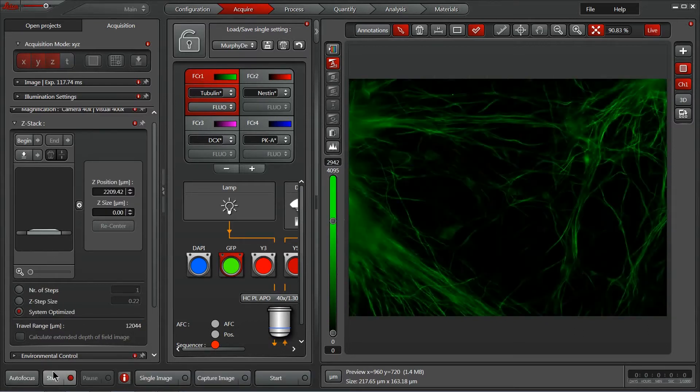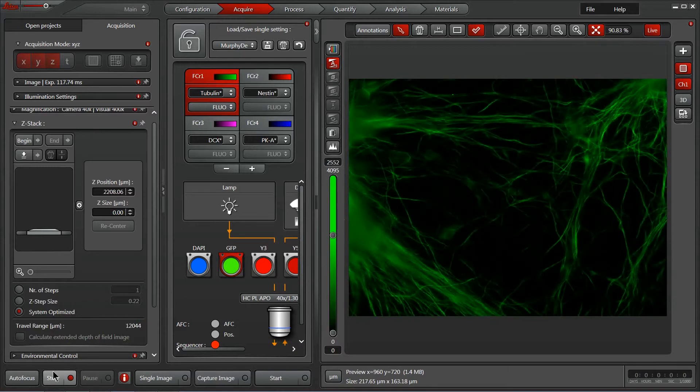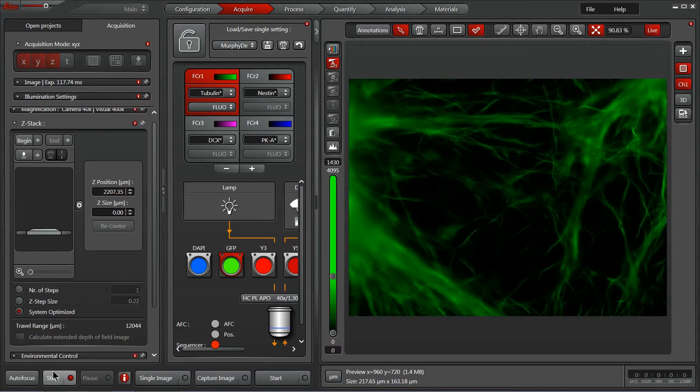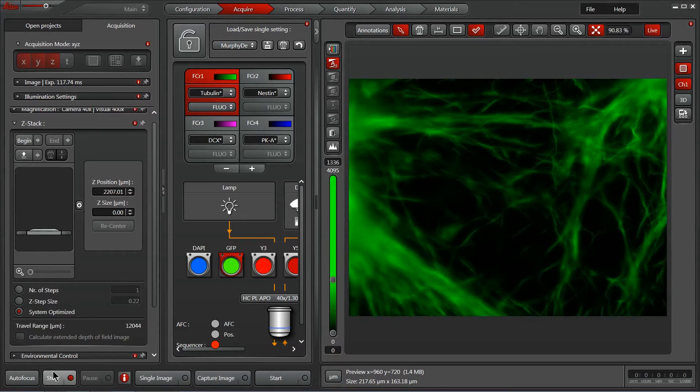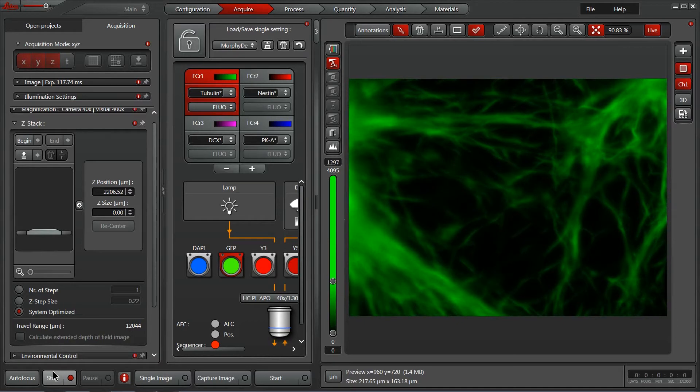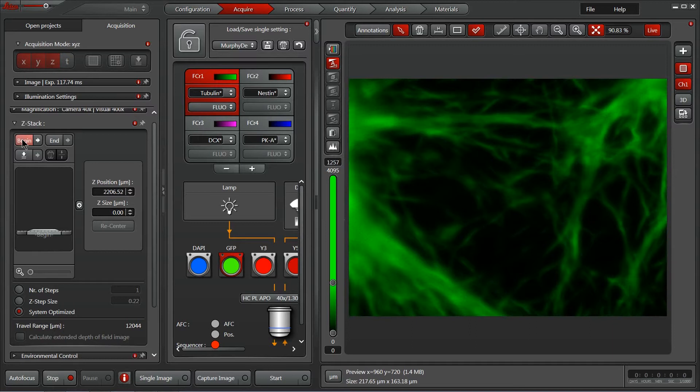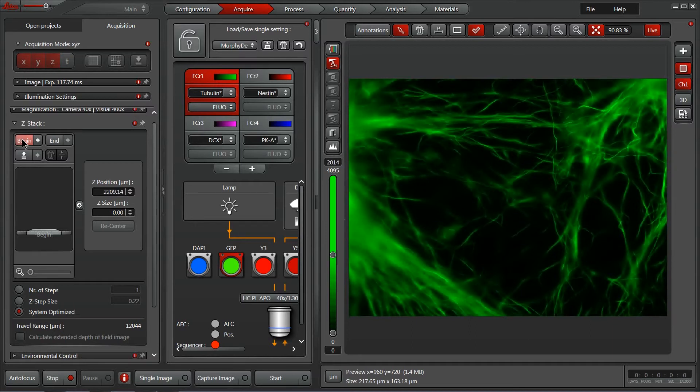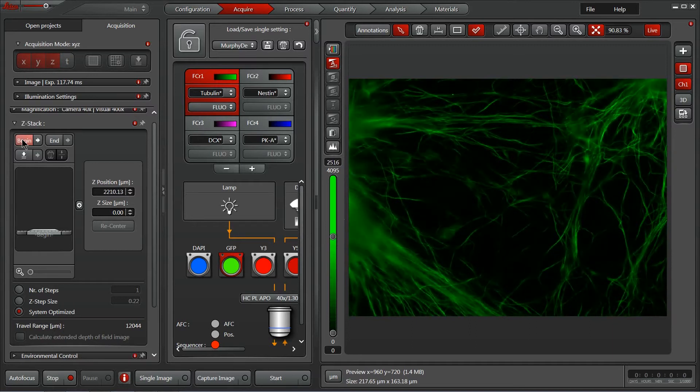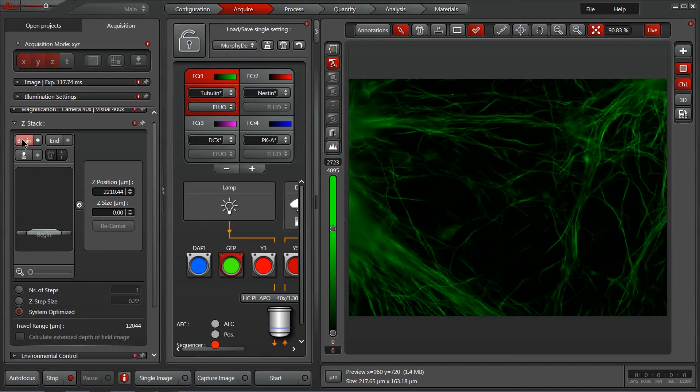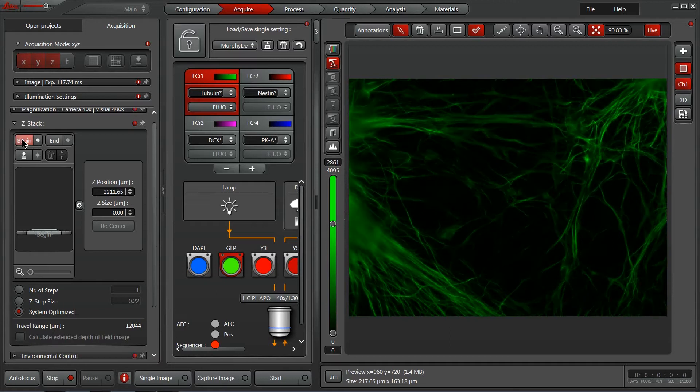Utilize the microscope Z-focus control to go slightly out of focus on one side here. I'm going to click begin. I want to be just slightly out of focus because I'm going to run deconvolution on this which will reassign that out of focus light to the right place.